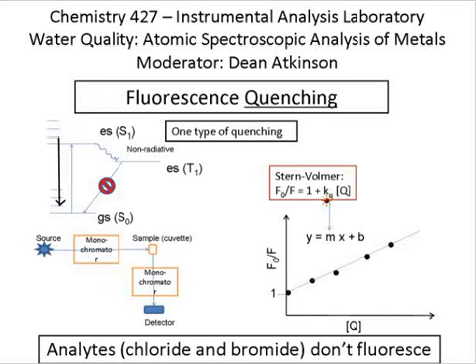So there's a linear increase in this ratio as a function of concentration of the quencher. So that's the governing relationship here. So what that means is that we plot a whole bunch of points that have different quencher concentrations. We should get a line that starts at 1. The intercept should always be uniquely equal to 1.00, and you should get an increase in the quenching, which basically is registered through this F0 over F.